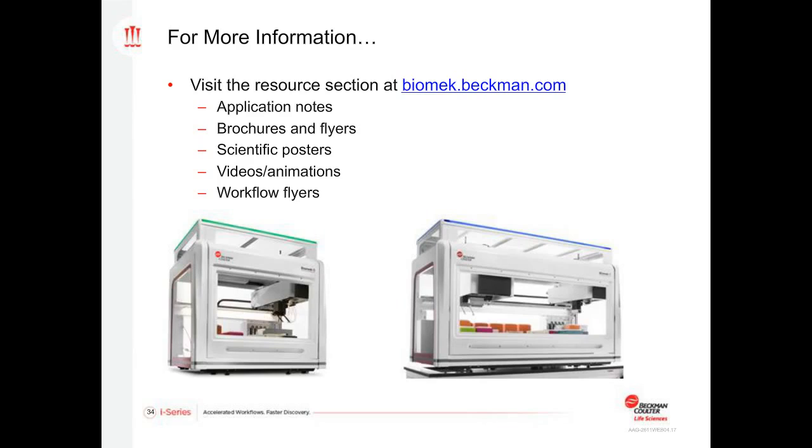How hard is it to adapt the automation to different workflows? That's also a good question. The workflows I've shown today were all essentially done using the same deck, but obviously it depends what system you'd be working on. Having the i7 hybrid provides you with the most flexibility, but depending on your workflows, if things are changing dramatically, you can imagine possibly needing to change what devices are integrated to the system.